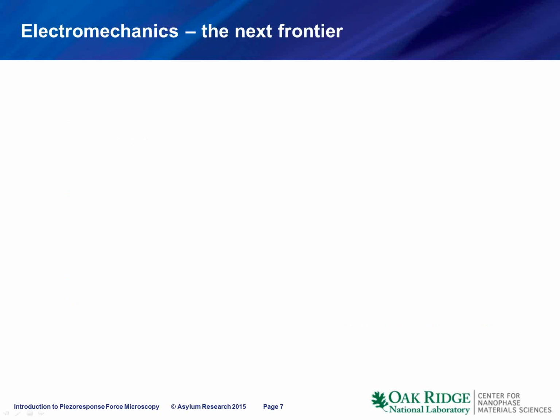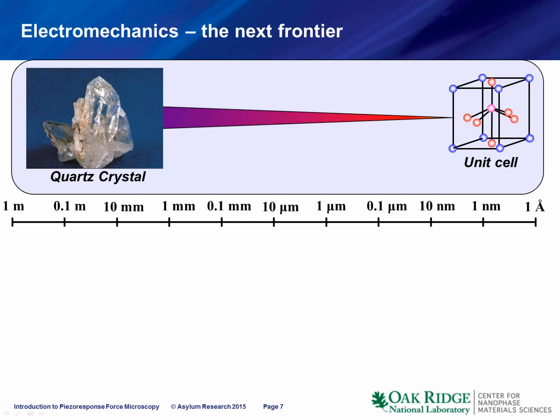However, before we make these applications a reality in whether 20 or 50 years, we really need to be able to study the electromechanical coupling locally. Let me illustrate why. For example, if I want to study a piezoelectric effect in the quartz single crystal, this is relatively easy. I can take a single crystal, I can put 2 electrodes across it, I can apply 100 volts, and I can measure how the crystal expands by several nanometers.